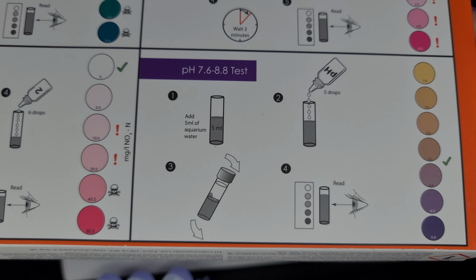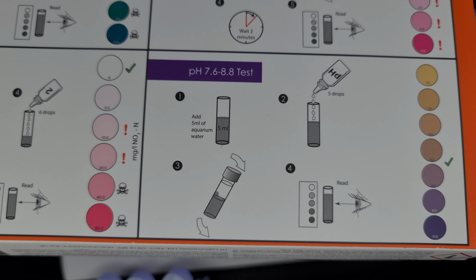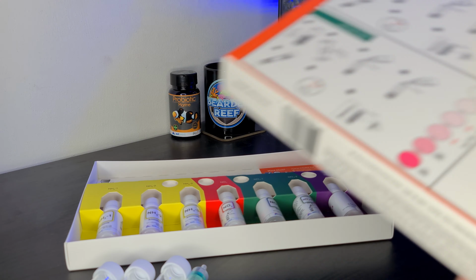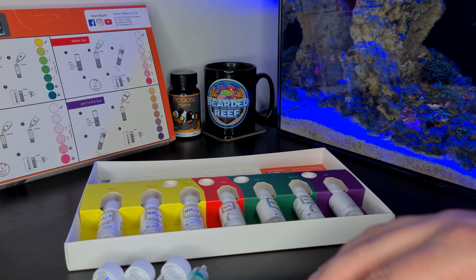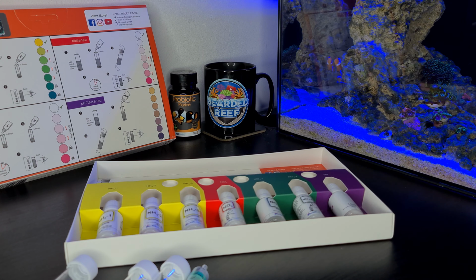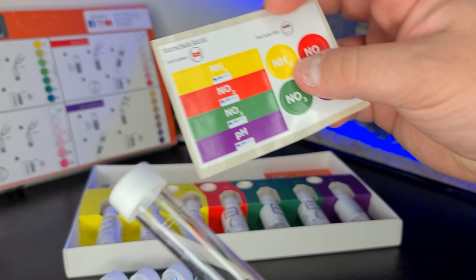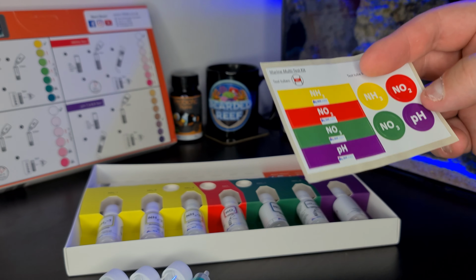So I might actually do the pH one and see where we're at with this first rather than doing the ammonia one. I think that's what I'll do. Okay, let's do the pH one first since that's the quickest. We'll get that one out of the way. Because these are all 5ml, I'm going to label up the bottles first actually. So I'll stick all these stickers on the bottles and then I'll come back.